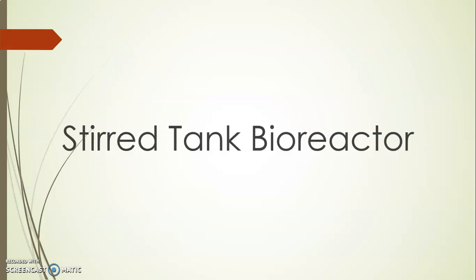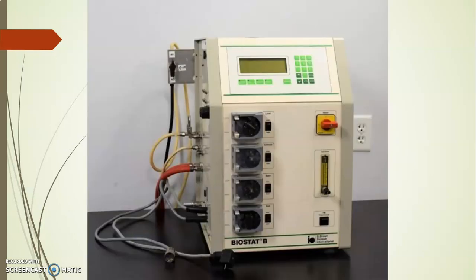Anyway, as the parts of a bioreactor are the point of interest today, the stirred tank bioreactor has been taken as a model. My discussion will be based on the Biostat bioreactor from Sartorius, a leader in this area. This is an old model of the Biostat bioreactor, it might be from somewhere around 2010 to 2014. It was very common in different labs. Okay, this is the controller.